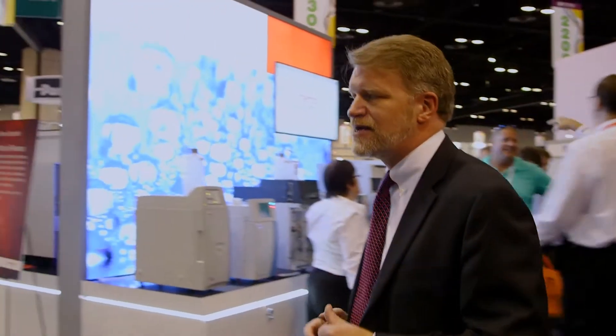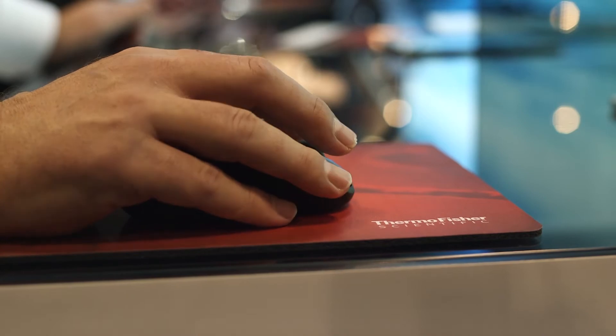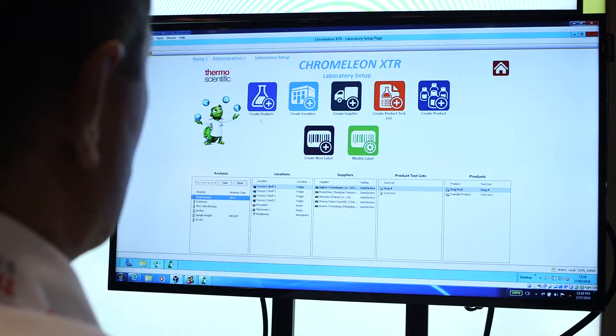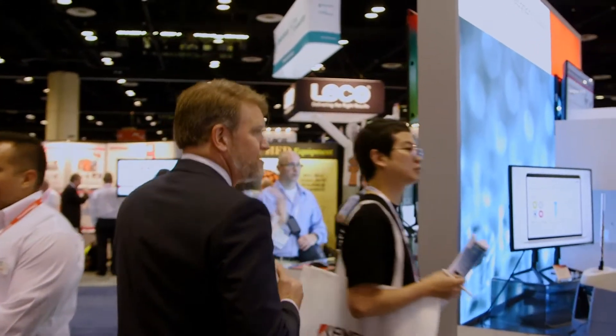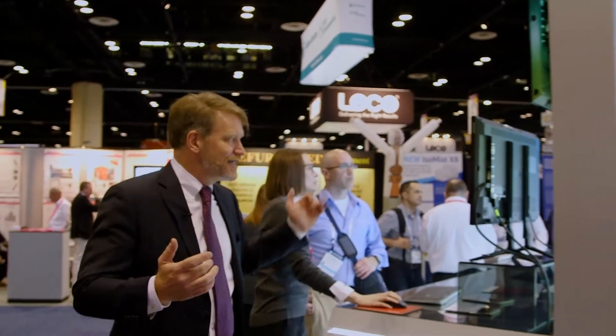One of the most important things that enable our chromatography systems is the software that drives them. One of the big strengths at Thermo Fisher Scientific is that all of our systems operate under the same software platform. Over here at our software informatics station, we're demonstrating our Chromelion software, which drives all of our chromatography systems and is capable of driving all of our mass spectrometry chromatography systems as well.